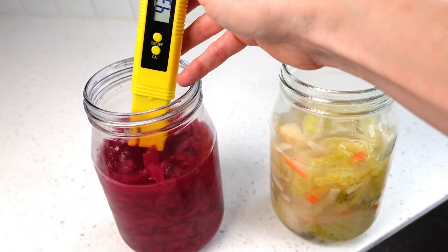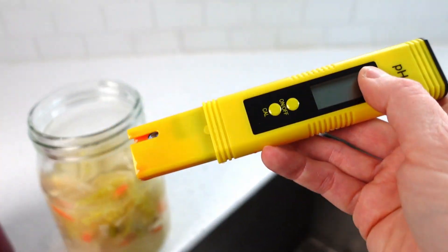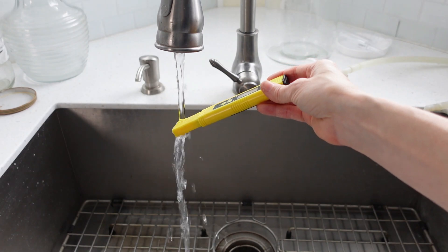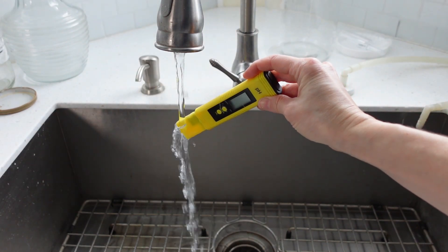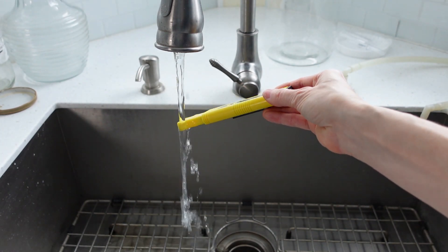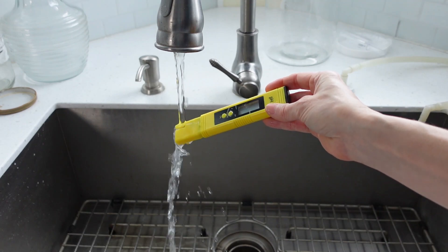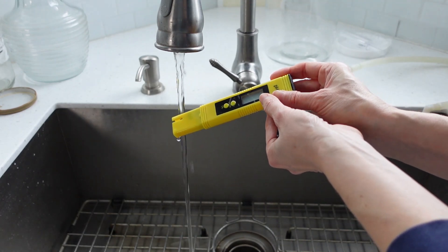As for cleaning, because the probe sensitivity is different for the meters, the only way to clean the basic meter is to run it under water after each use — do nothing to it except run it under water, not even soap. If you use any type of device to reach in and scrub the probe, you will ruin the meter. The probe cannot handle contact and will not read accurately ever again, even if you recalibrate it. I learned that lesson and had to buy a new one.